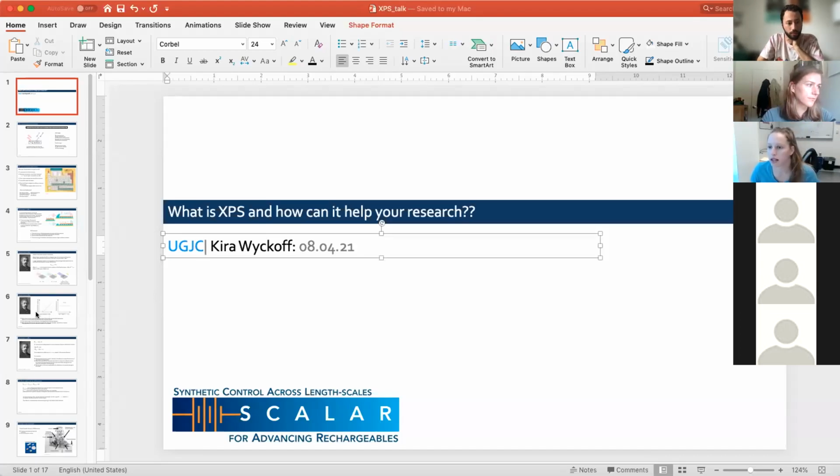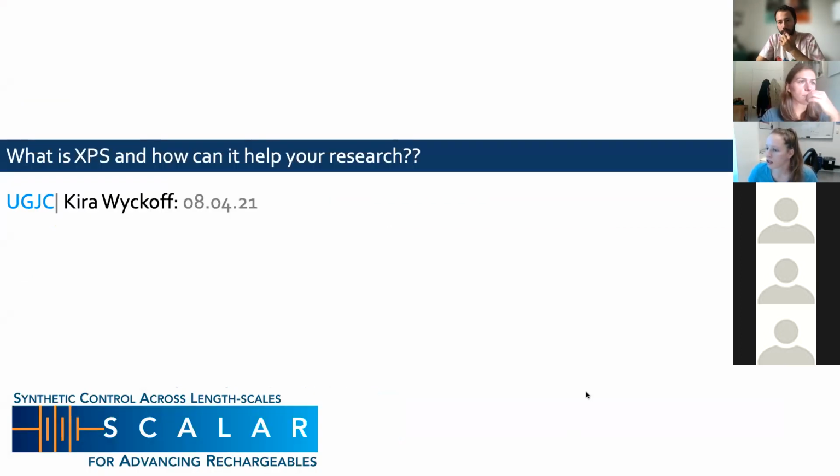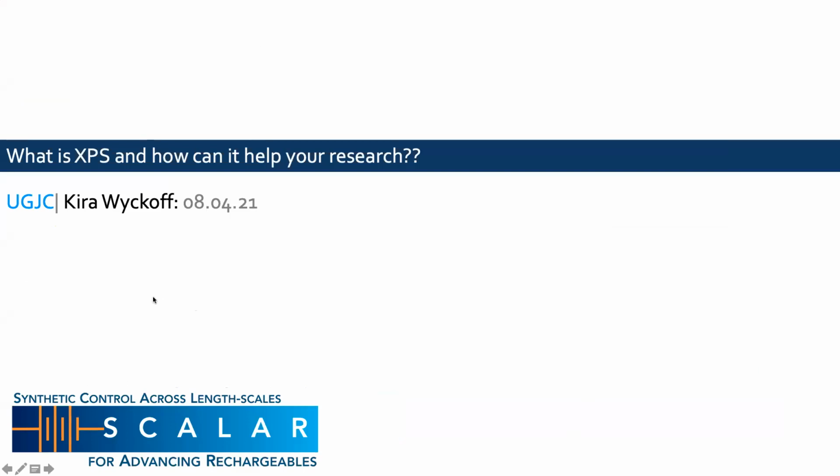So today I'm presenting on XPS, which is a surface technique that I've used a fair amount for helping to understand battery materials. It's a really powerful technique that's used in a lot of different fields. It's not just limited to material science. It can help you analyze surfaces in a multitude of different types of materials. I think even in the biomedical industry, they use it as well.